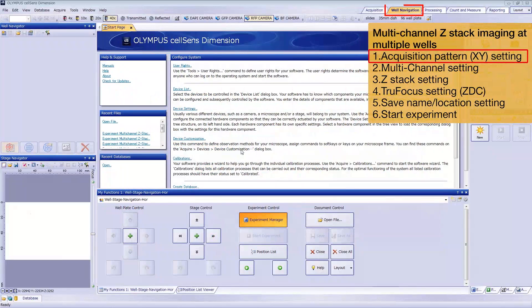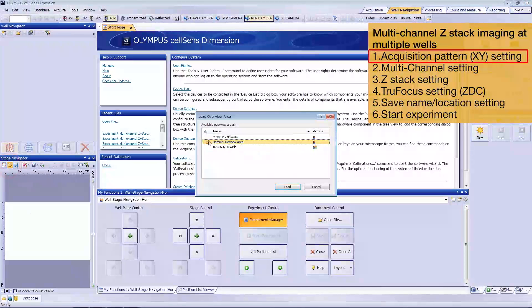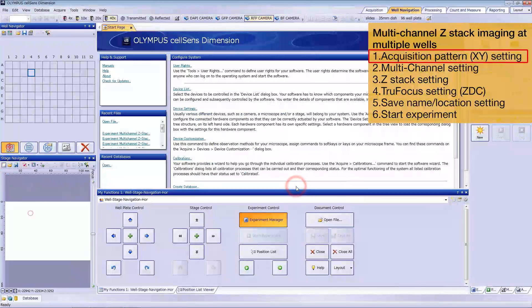First, make sure the Well Navigation Layout tab is open. Click Load Overview Area to open the well plate data that you registered. If you haven't registered your plate, please refer to the first video in this series.